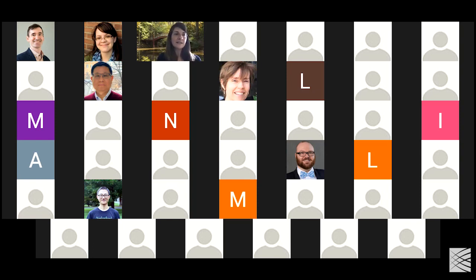So again, when you're making a set table, you need to have the first column have a very specific syntax. It needs to be membership : and whatever entity name you've given your entity table. So if you made a sample table, this entity name needs to be sample. And then it's _set_ID. If you made an entity data table called participant to start with, and you uploaded that to Terra, and you wanted to make a set table from your different participants, this name would be changed to participant here.